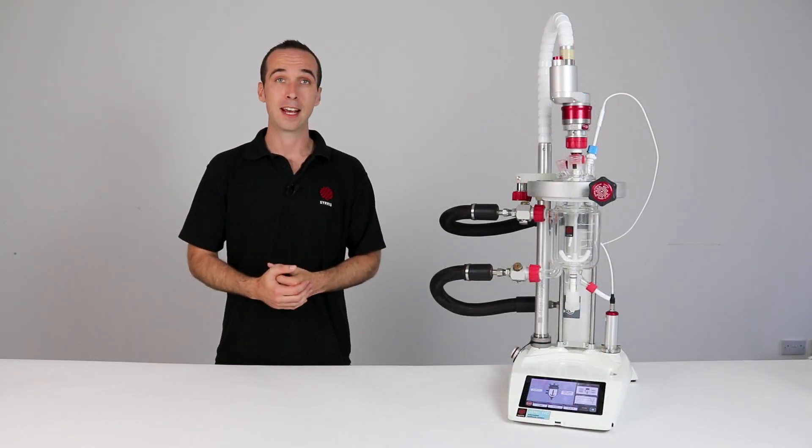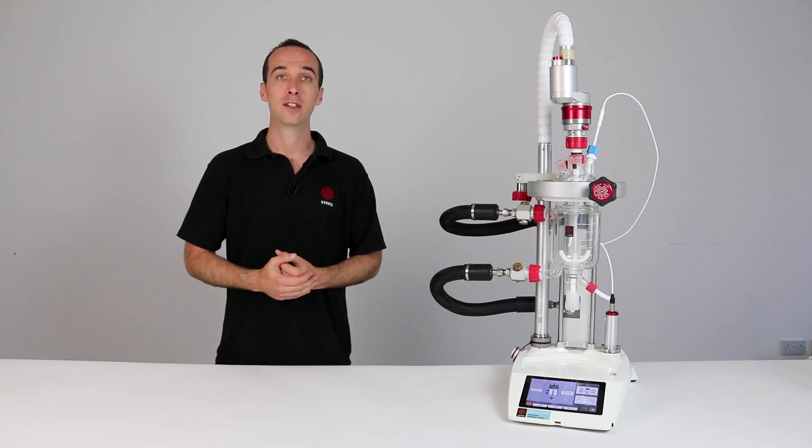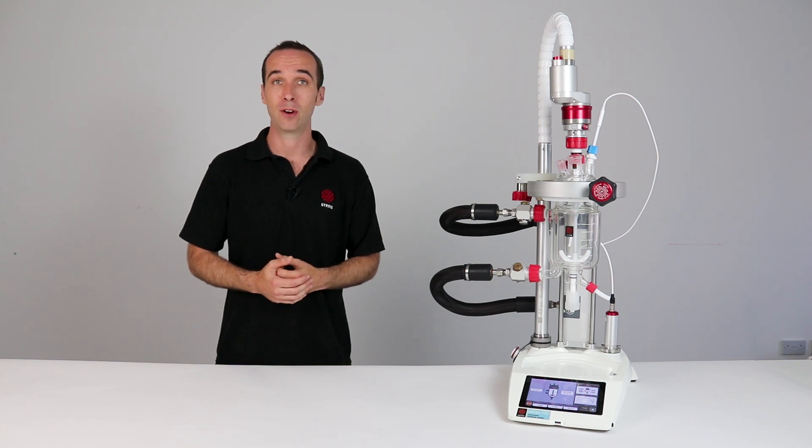Seamlessly add the Atlas HD to your existing Atlas Reactor platform to unlock all of these powerful new features. To learn more or for a quotation please contact info at syrris.com for more information. Thank you.